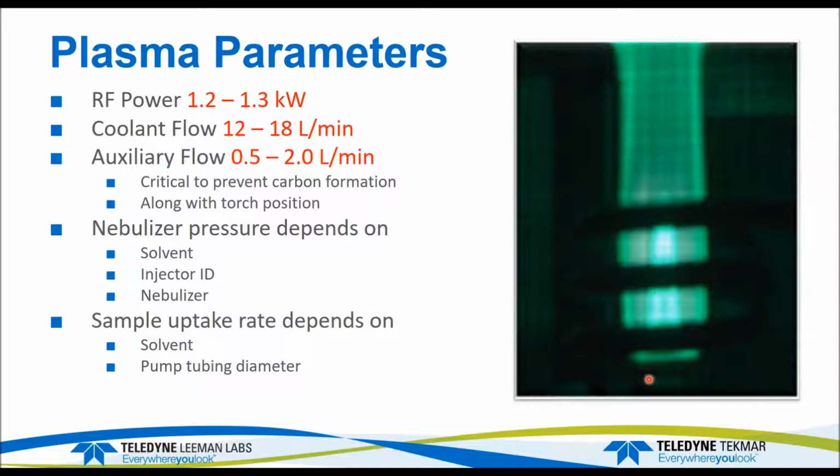We'll look at what feature of the torch system is used on this instrument so that you can maintain the proper spacing when you take the torch in and out.